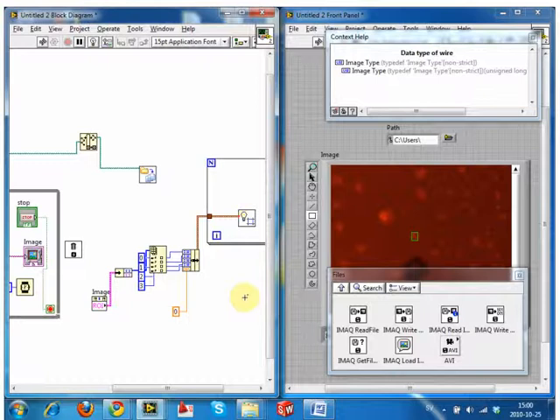But if this was done on the confocal, where essentially it's a gray image that then maps to a color, we'd need to extract the red color plane. Because this was done on a color camera, this is a better way to do it. If it was on the confocal, extract the color plane. I'll show you how to extract the color plane maybe next time, or the time after, when we use the confocal images as an example.